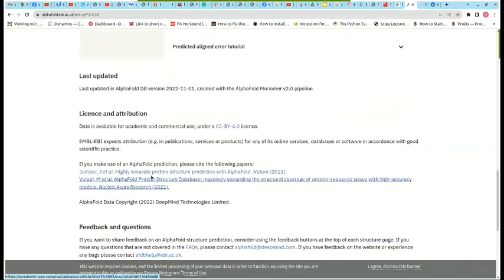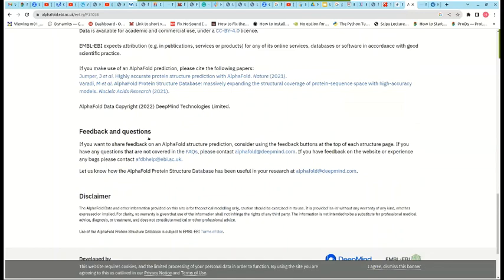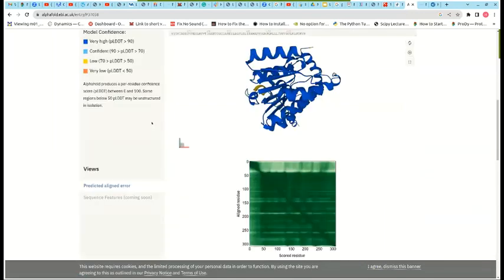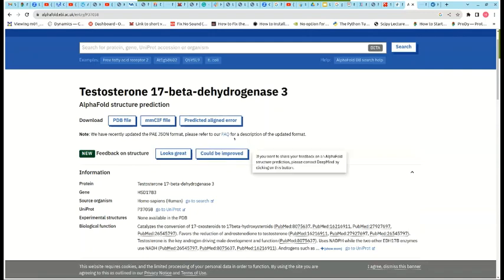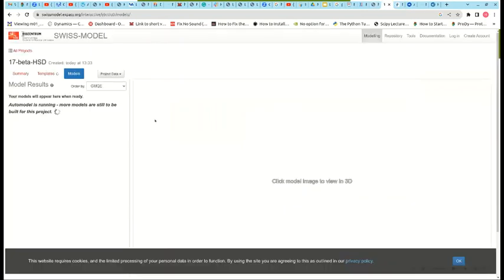But it's always good to have like 1 to 3, because by the time you get to your docking, this structure may not really work; you could have some steric hindrances and the like. That's why it's always good to have about 2 structures. So I can download this directly from AlphaFold and continue to dock with whatsoever tool you want to use. It could be AutoDock Vina or Schrodinger Maestro, and then continue with my further computational analysis. So let's go back to Swiss. Swiss is still running.